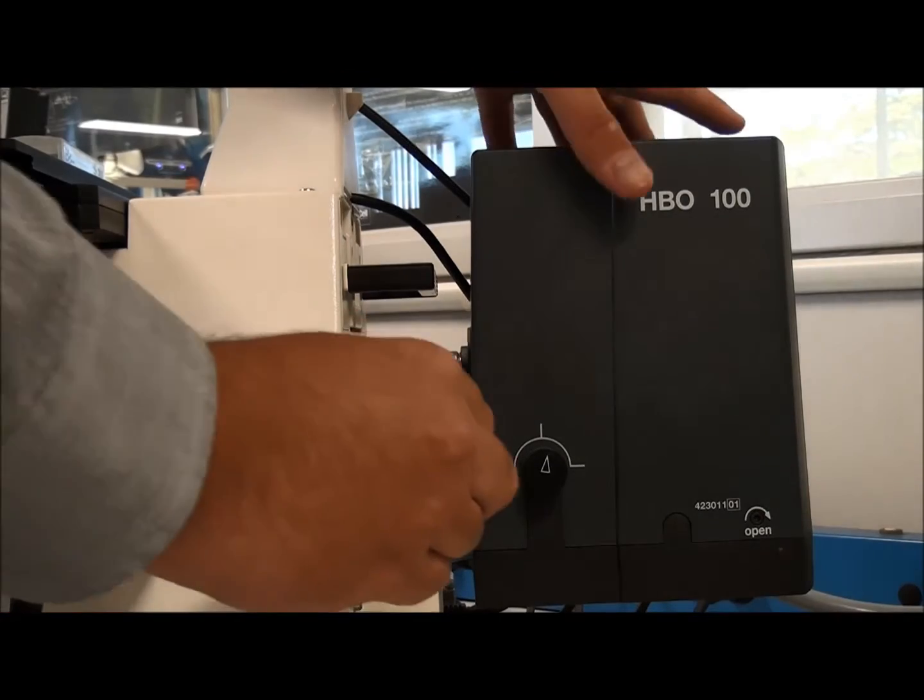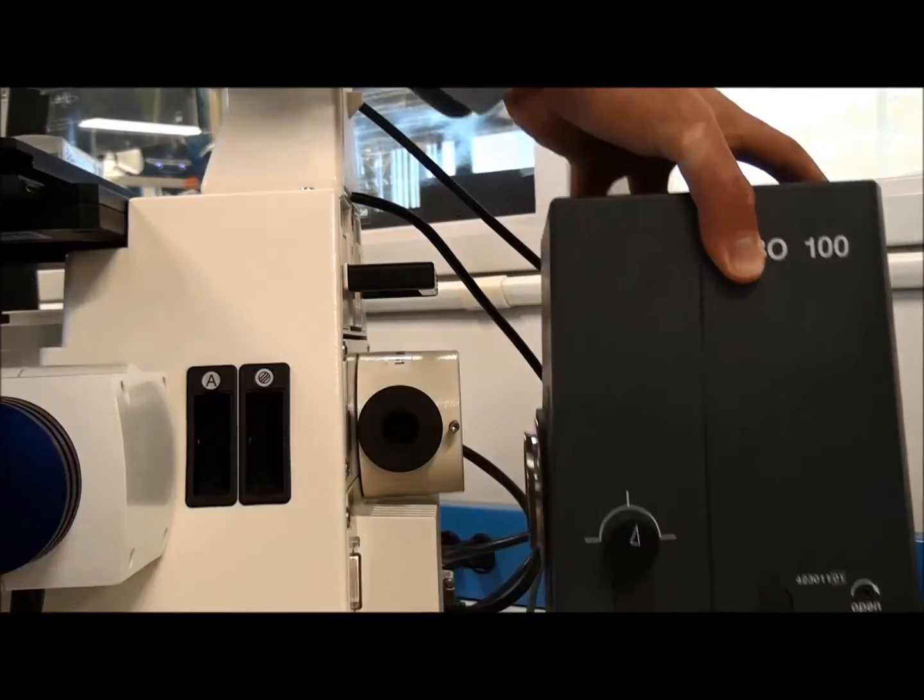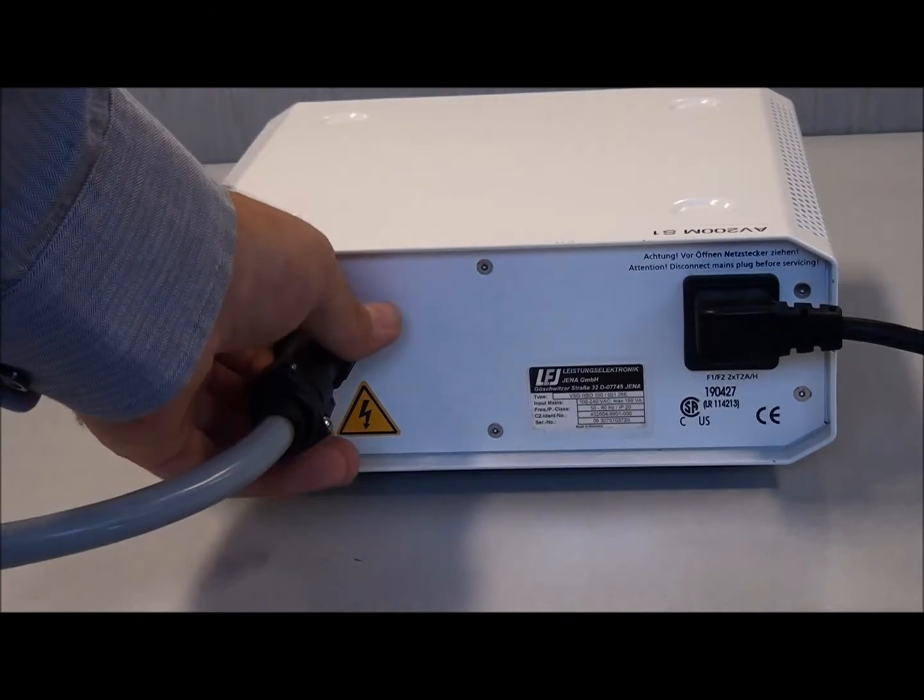Removing the lamp housing from the microscope is not necessary, but can make the process easier. Disconnect the power cable from the HBO control box.